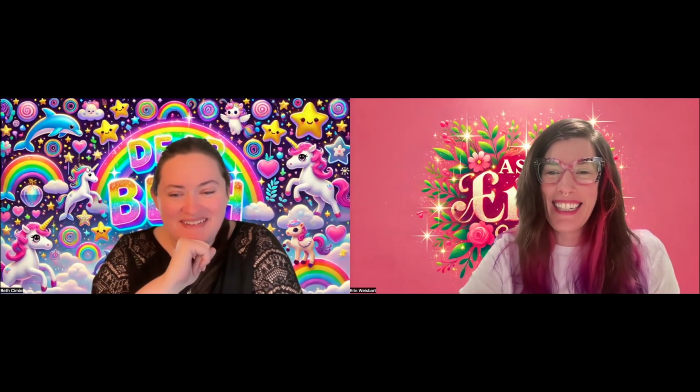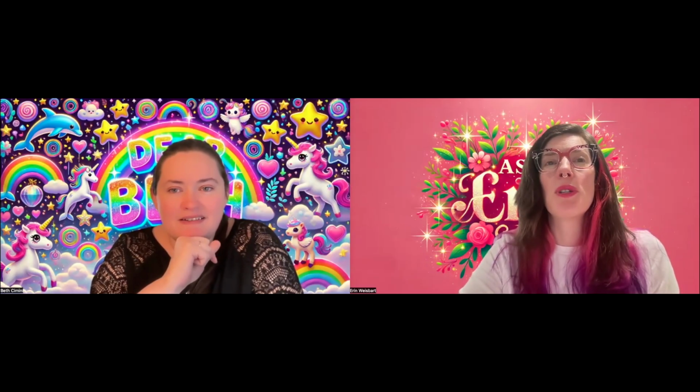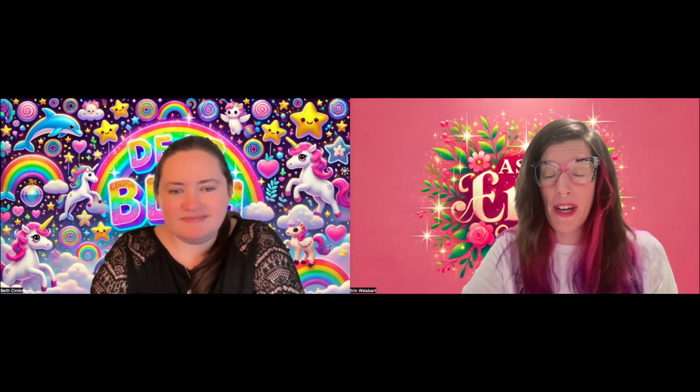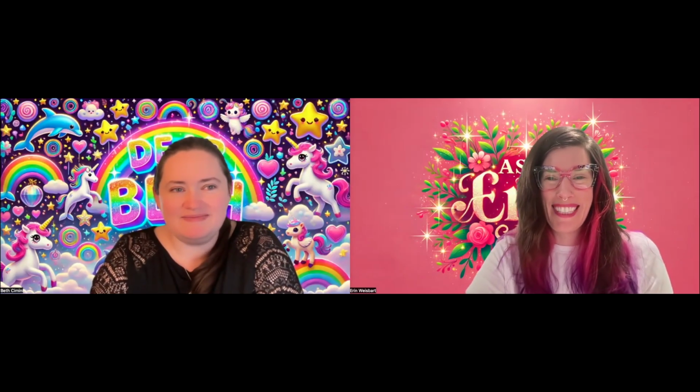I can't wait. Yeah, and we will soon explain how to, instead of, here, this is just a binary filter, yes, no, in an upcoming episode we can actually calculate distances from objects to objects. Great. Awesome. Looking forward to it.